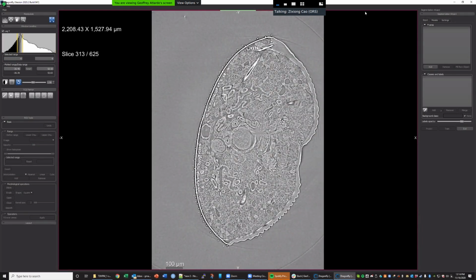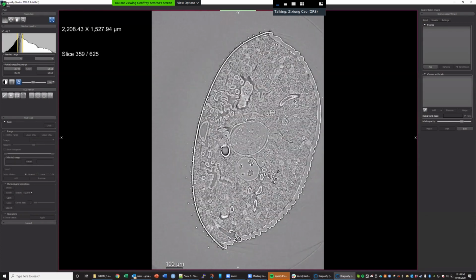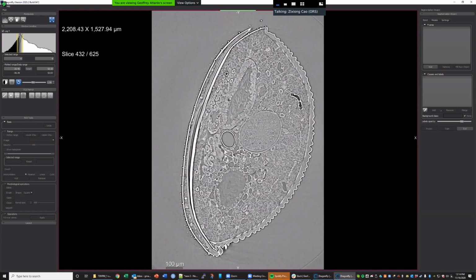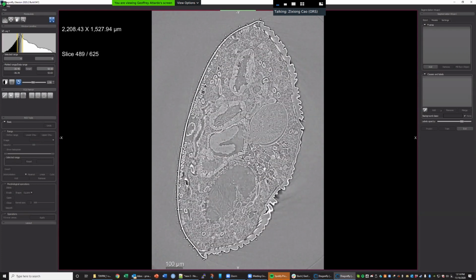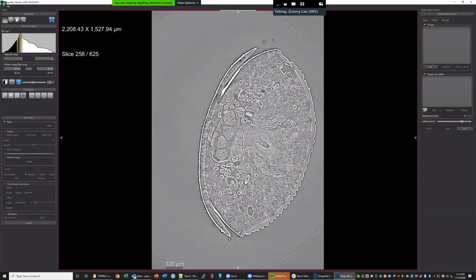It's totally fine. I just remind you, we are working on another wizard. If you want to try multiple times, it's good to start with a different wizard, because if you delete it, you probably won't be able to recover it later.